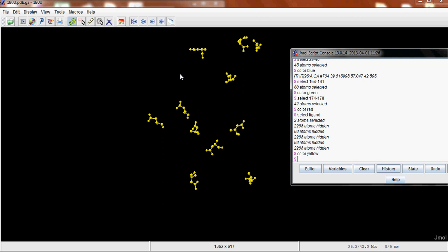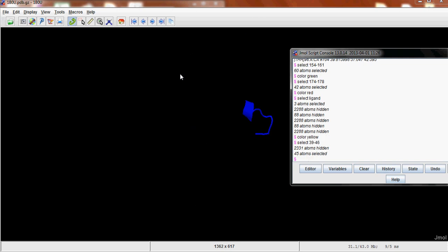So because you're looking at motif A, you're going to want to give that a Ball and Stick model as well. So you're going to want to get that back up. So if you go Select 39 to 46, you'll get it back here.